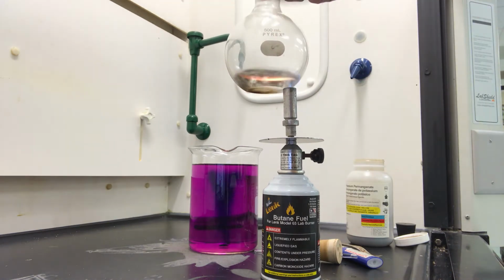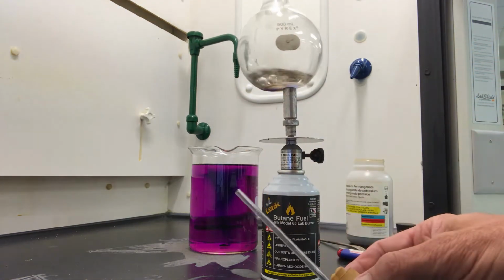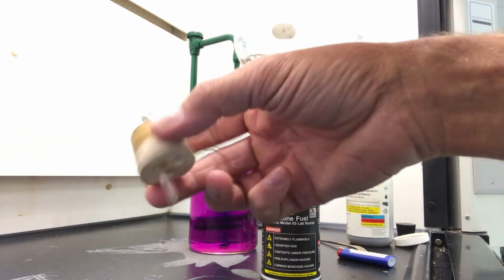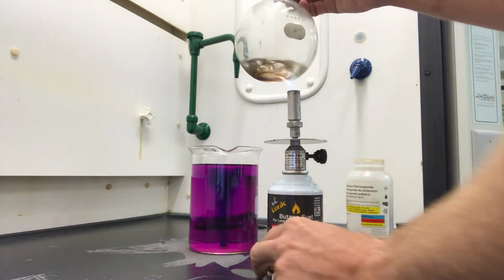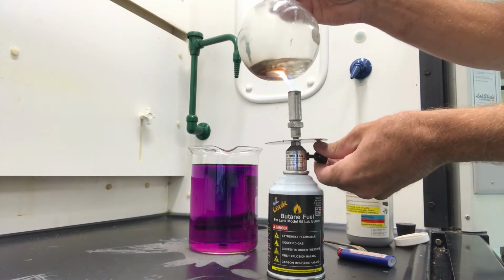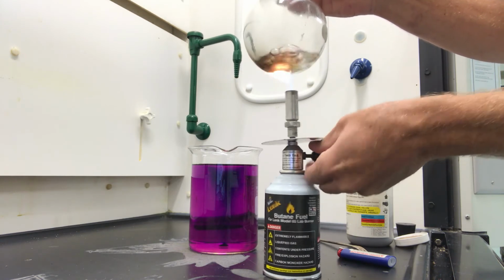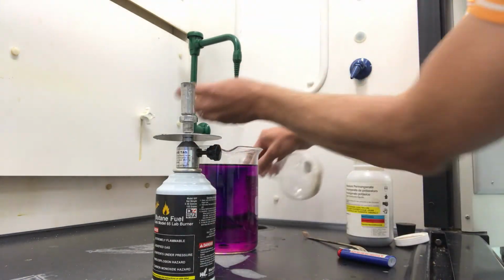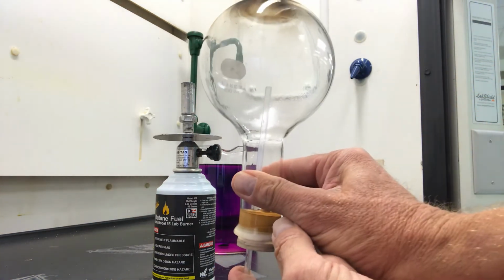So ammonia gas is filling this. What I'm going to do is take the stopper and put it inside there and seal it up. But there's a glass tube inside it, you can see. I'm going to put my finger in to stop it. But I want to get rid of the liquid, so I'm going to pour the liquid down the drain. Turn this off. So now this jar is filled up with mainly ammonia gas.